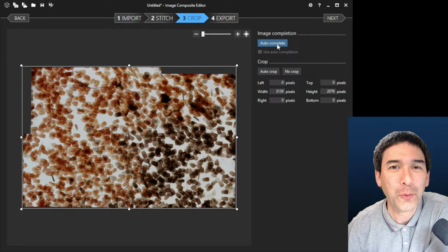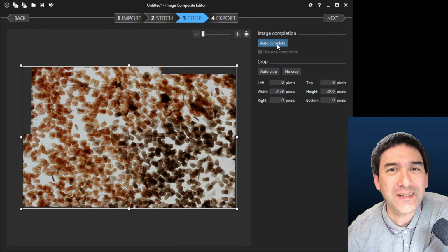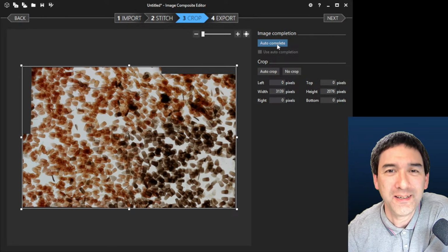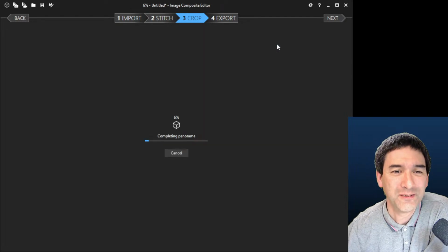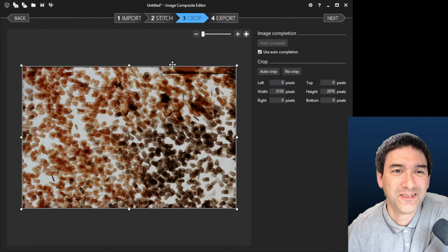Let's try autocomplete. You shouldn't be doing that because you're kind of creating image information that doesn't actually really exist, so you're actually kind of faking it. But let's try it in any case. Not tried it yet, but it will now. You see, it didn't work quite well, but you see it tries to fill in, copy paste something in here. No, it's not something I would do.